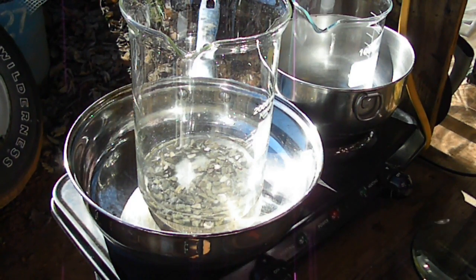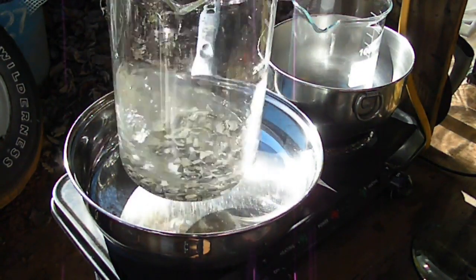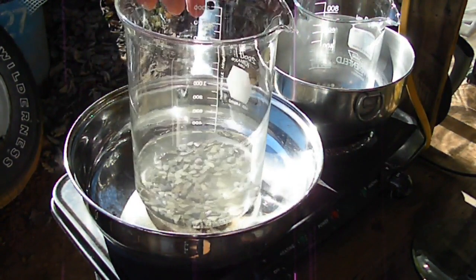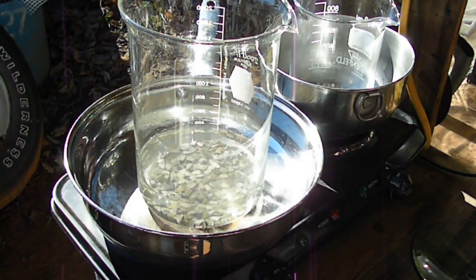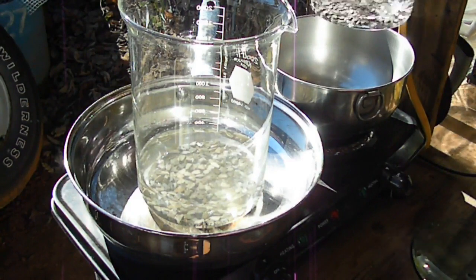So let me get a little bit more, which is actually a little acidic, but it's okay. So we're going to start with 350 in the big one. I'm going to put about 150 in the little one, and then we're going to start slowly adding our nitric acid. Can't really see the little one that well, but you'll be able to see the big one. And I'm using oversized beakers, mainly just because it spreads everything out across the bottom. You get more contact with the acid on the contacts.